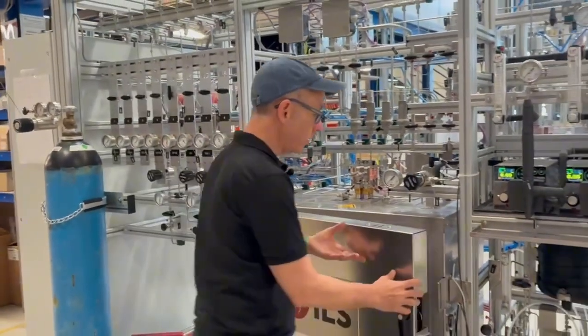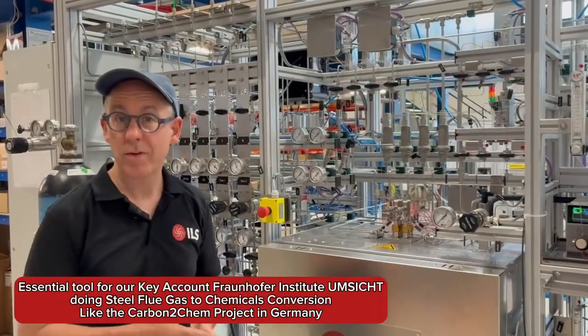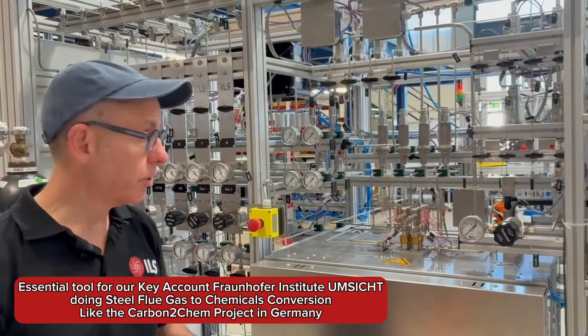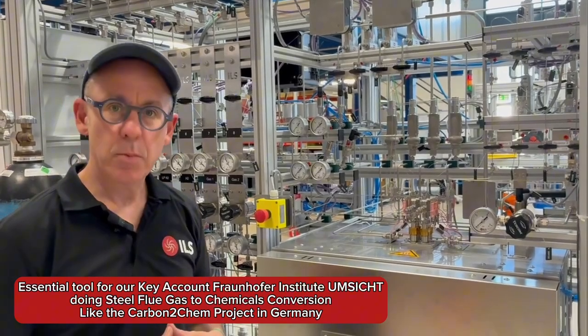This unit has just undergone its final FAT commissioning here, and then will be sent off to our client. In this case, it's one of the Fraunhofer Institutes, which is an excellent reference for us. We've done a lot of work with them in chemical projects, which are very much focused around valorizing CO2 or flue emissions to make valuable products out of them.